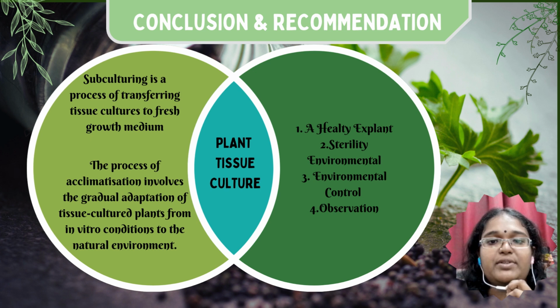Last but not least, observation. It is important to monitor the subculture and the acclimatization of the plant. During this time, we must ensure their process of growth and avoid any type of contamination during the growth time.